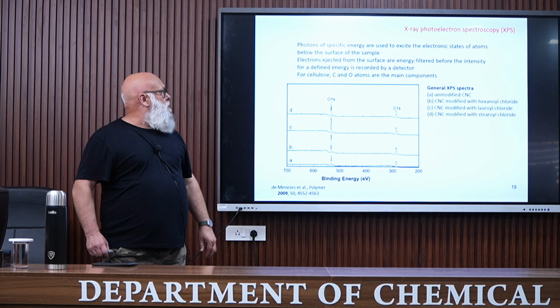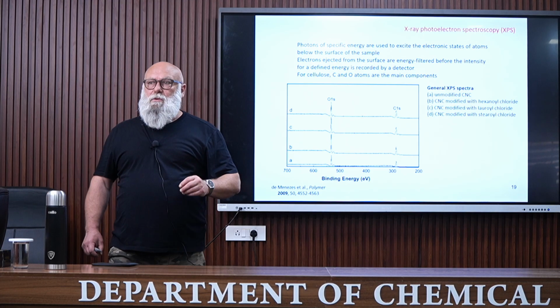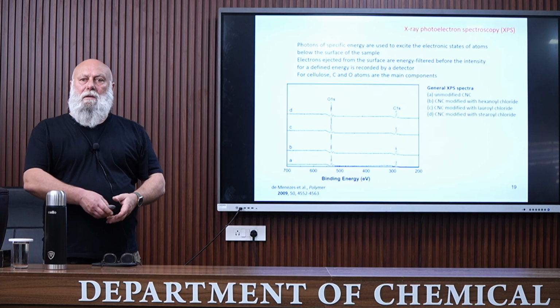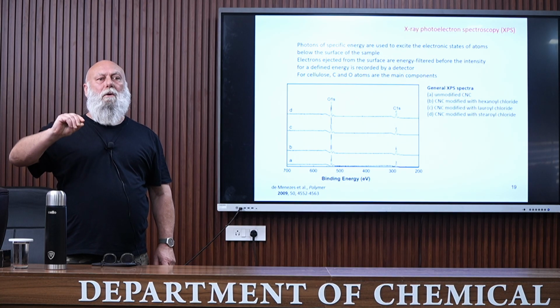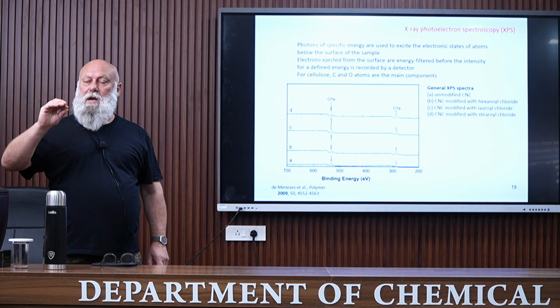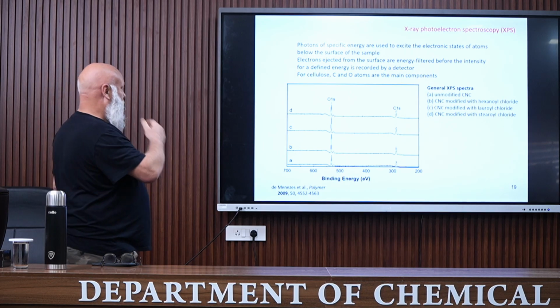X-ray photoelectron spectroscopy, XPS. This is an interesting technique to study the grafting efficiency of biocomposites because the depth of investigation is very low, around 7 nanometers, meaning that it's really an investigation of the surface of the nanoparticle.